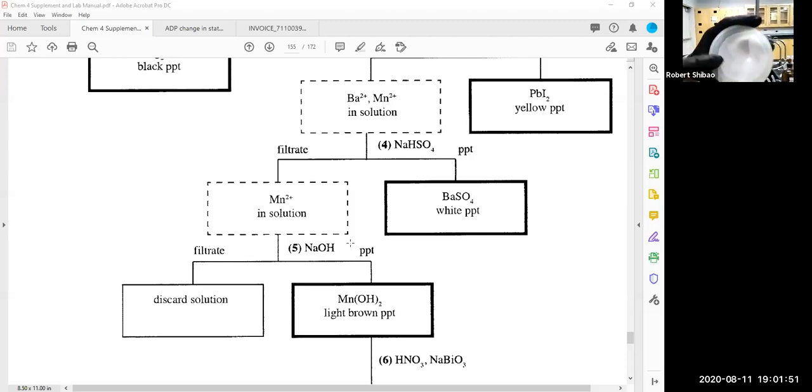Now the question is, is that excess lead-2 chloride that just wouldn't dissolve, or is that silver? And so we're going to test this with some sodium hydroxide. So I've got my waste beaker over here, and I'm just going to pour some sodium hydroxide and let the filtrate go into waste here.